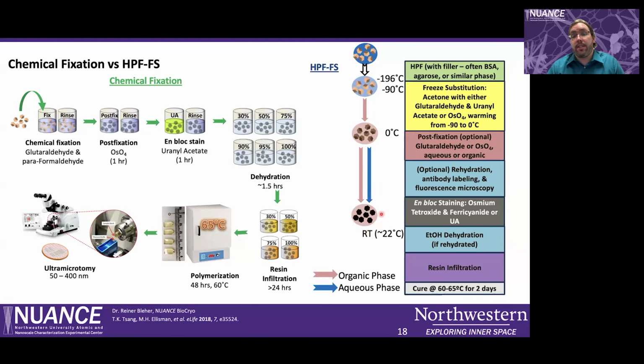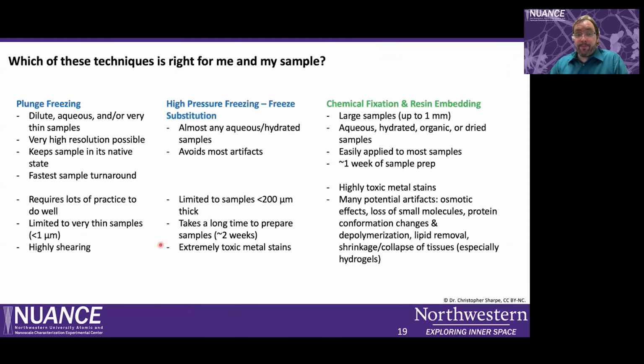Regardless, though, you'll end up with your heavily stained sample at about room temperature. And then, depending on whether you moved back to aqueous or stayed in organic phase, you'll go back into the dehydration and resin infiltration workflow from chemical fixation and generate your final sections. So just to quickly summarize, and help you pick which technique is right for you and your sample.